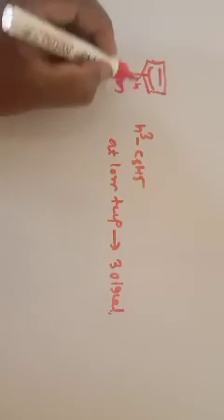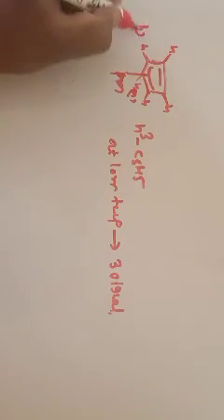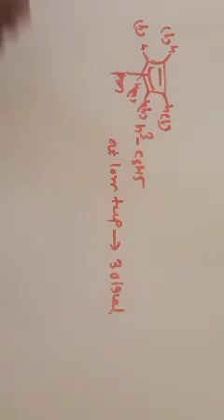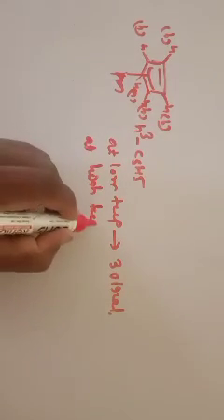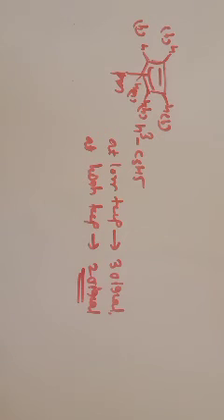So there are 3 types of protons, 3 sets of protons. At low temperature, that is at minus degree temperature, it will show 3 signals, but at high temperature it will show only 2 signals.